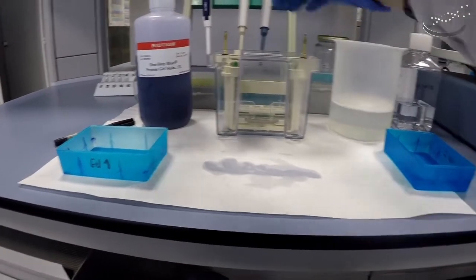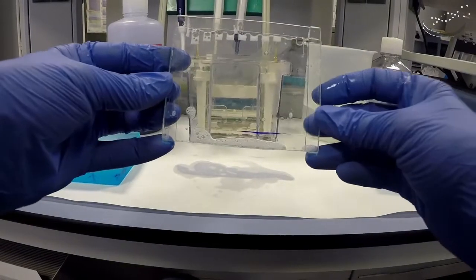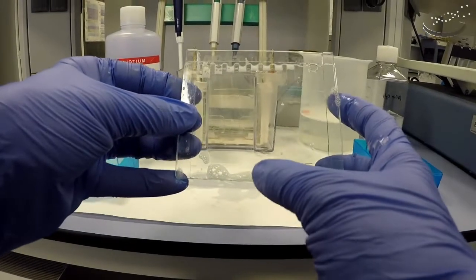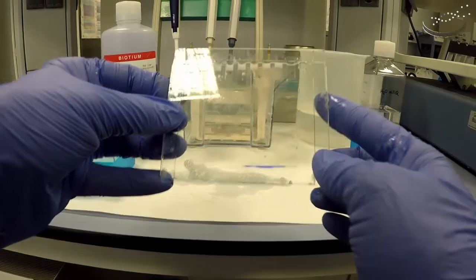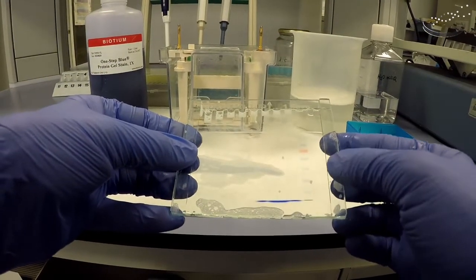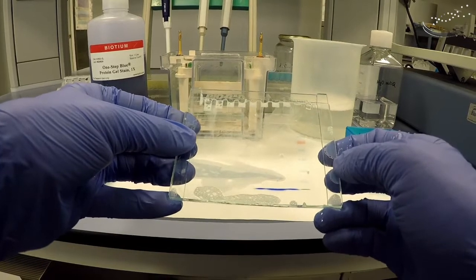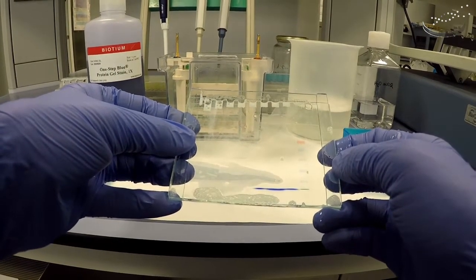Now our gel has run. We can see here the front of the gel is down towards the bottom with this blue line — that's where the bromophenol blue in the loading buffer has run to. You can also see on the side the pre-stained molecular weight markers in this well. Those are pre-stained, which is why we can see them now. Our protein samples are not stained, so we don't see anything yet — just where the gel front ran down to.